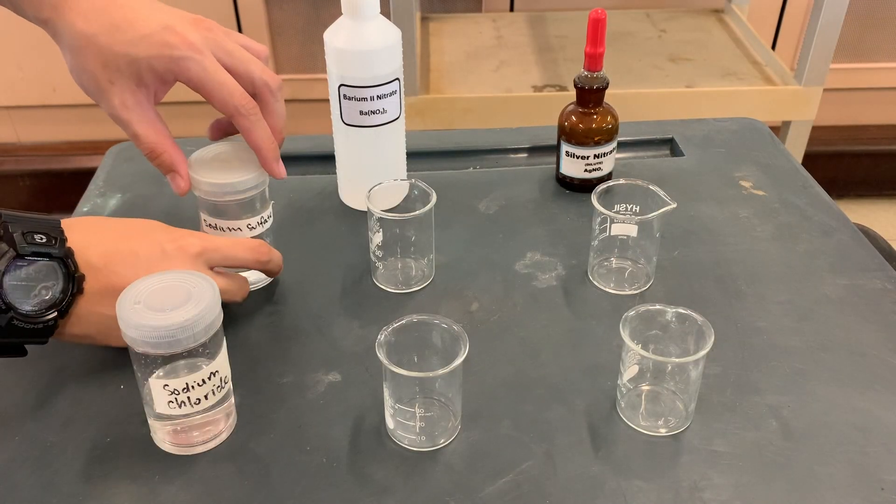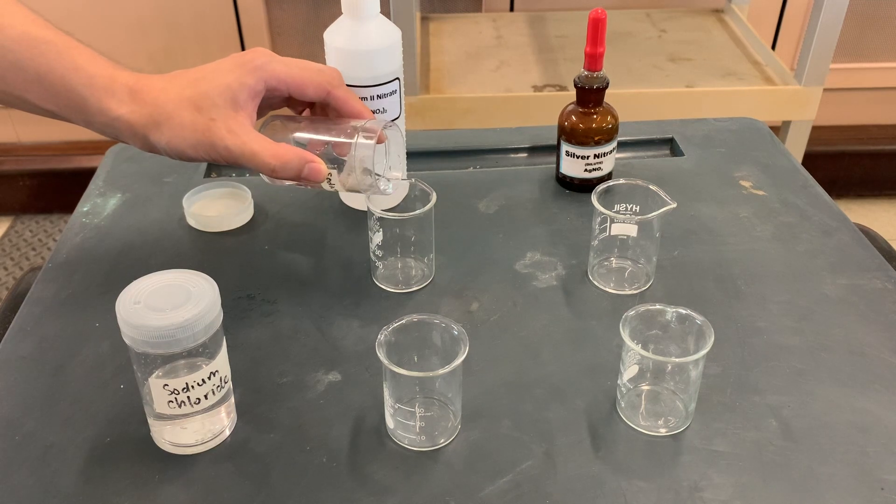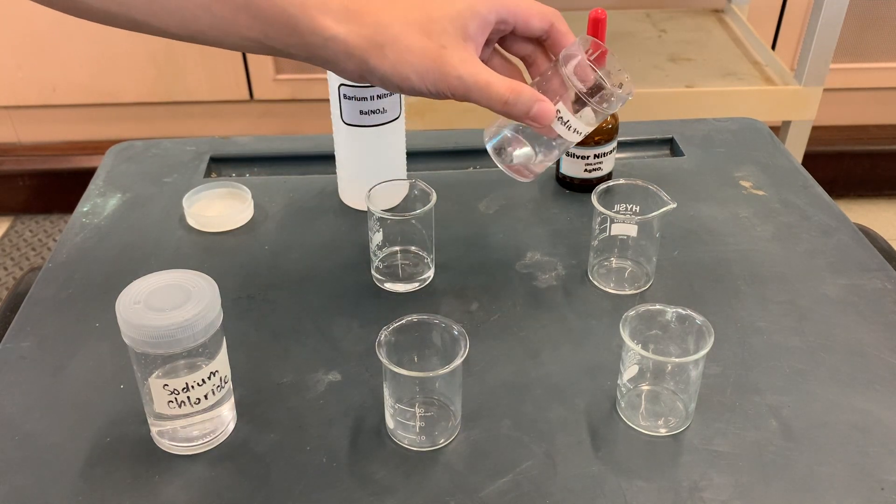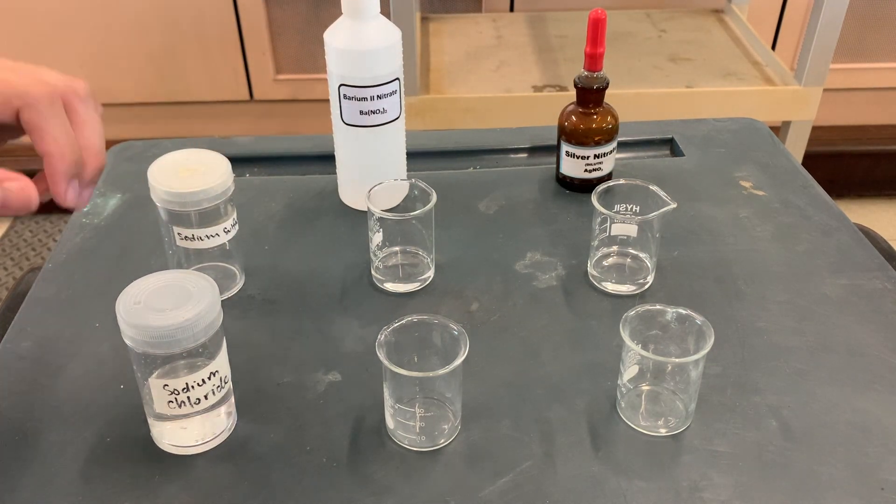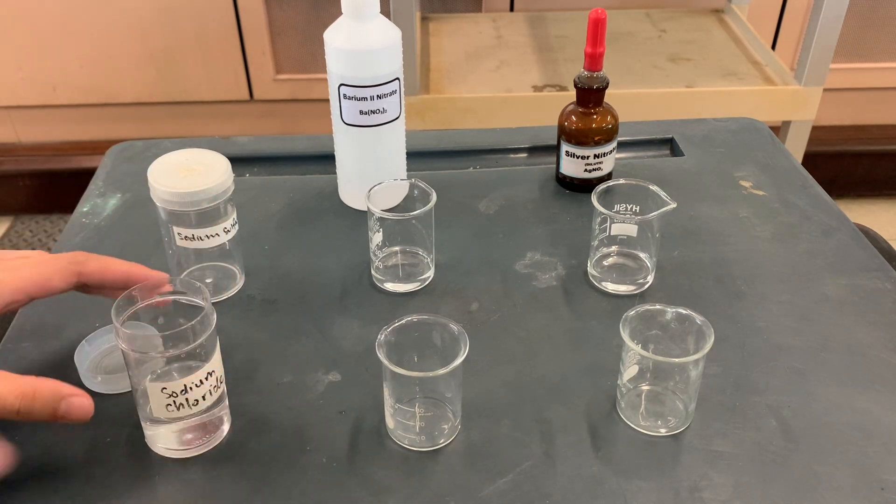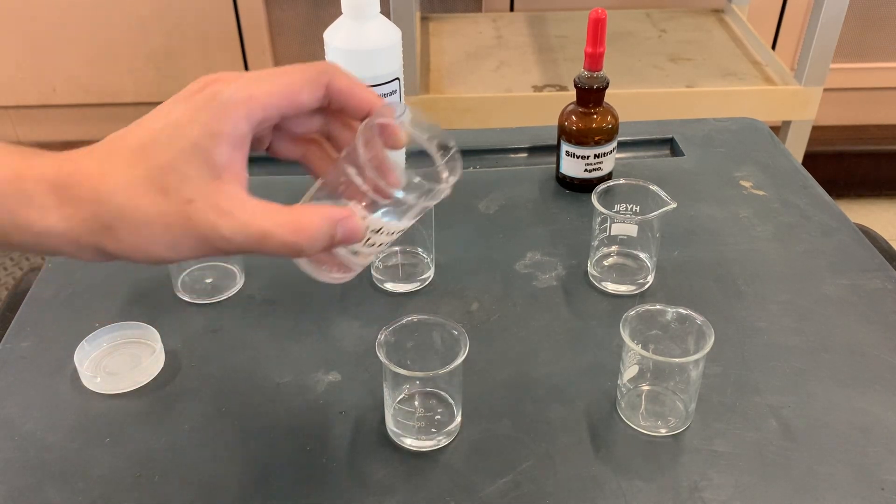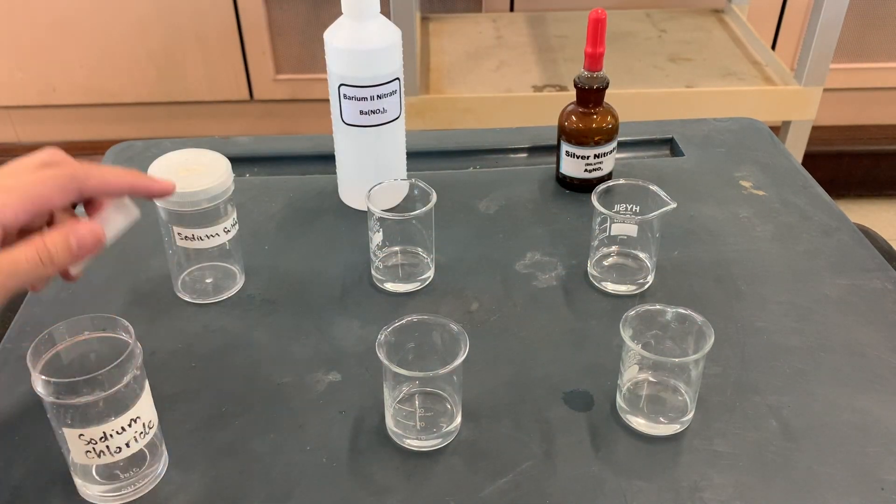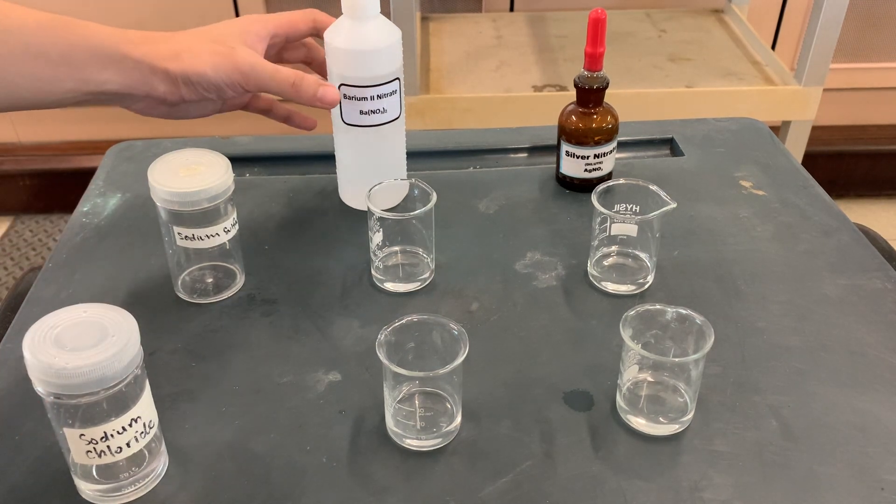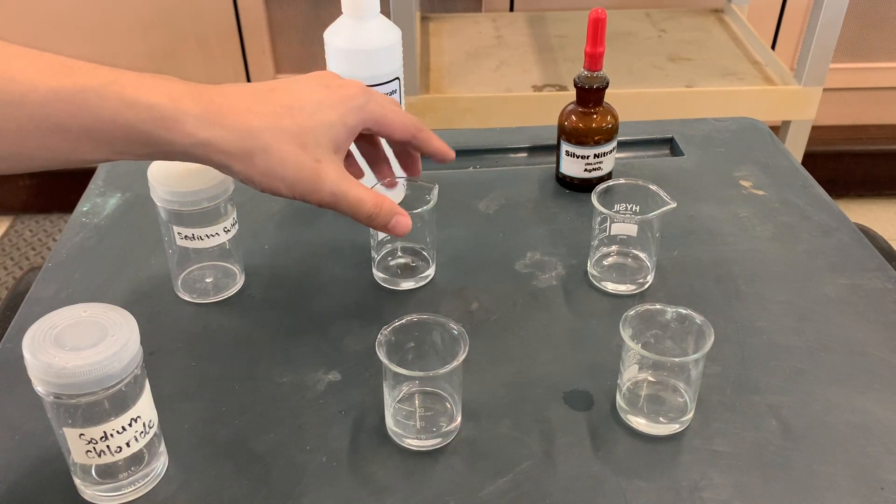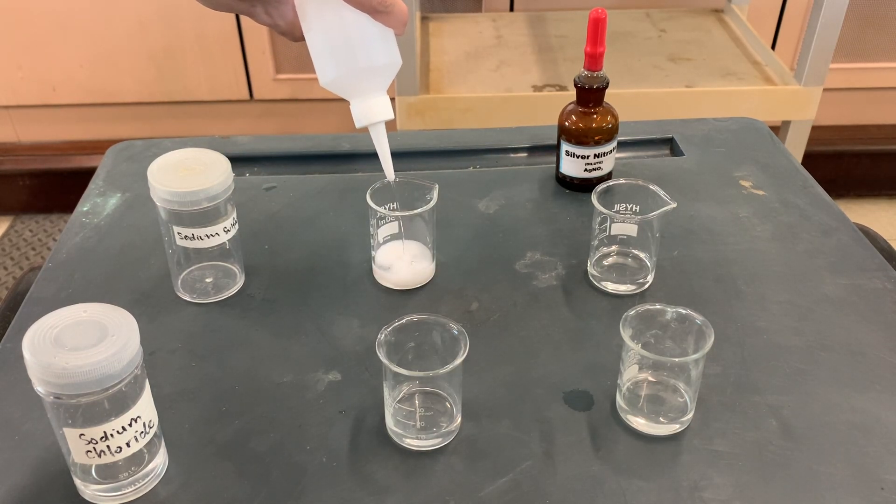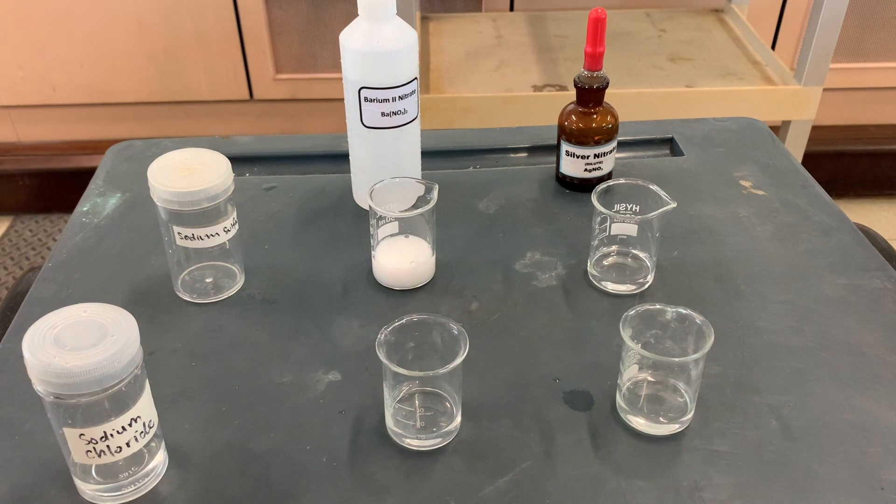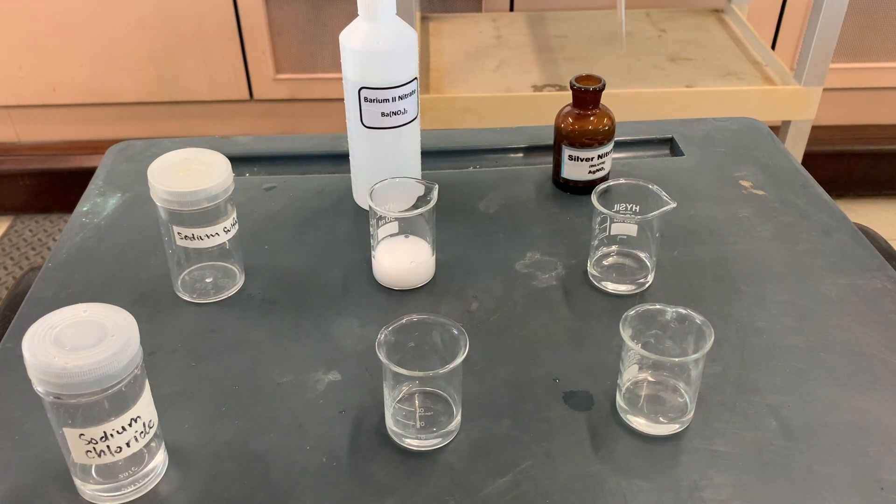Okay, over here we are going to carry out the demonstration. Let me start by pouring some sodium sulfate into this beaker and also some over there. I'm also going to add some sodium chloride into the beakers at the bottom. What do you think will happen if I were to add barium nitrate into the first beaker? A white precipitate is seen.